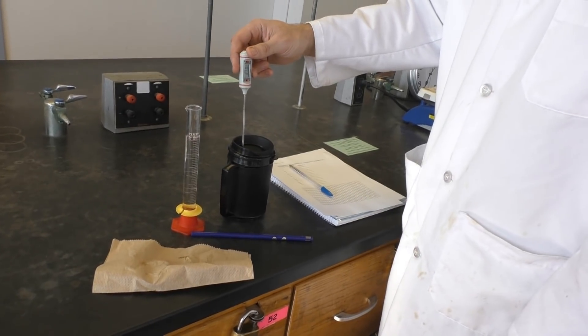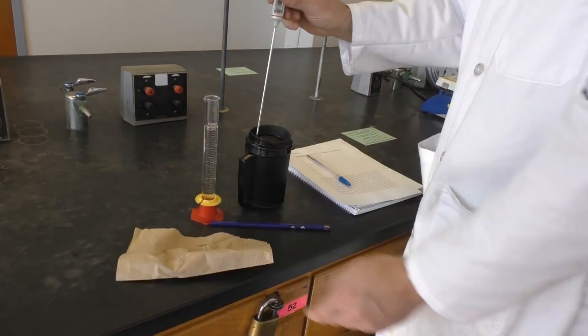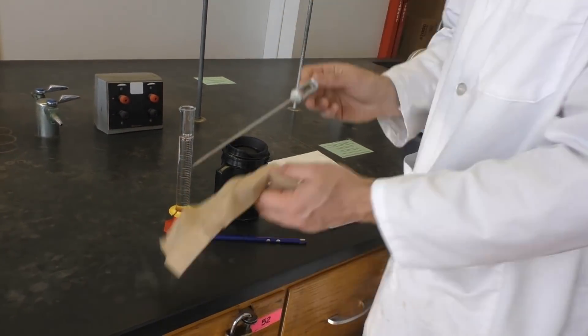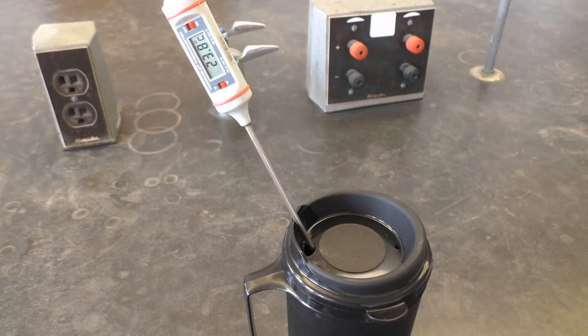Next, you need to get your acid and base to the same temperature. Just be patient and be sure to wipe off your thermometer between solutions. Once your solutions are at the same temperature, write it down as your time zero temperature.